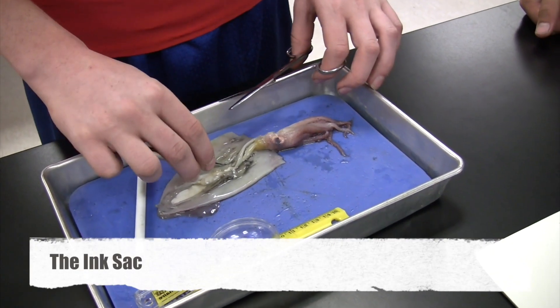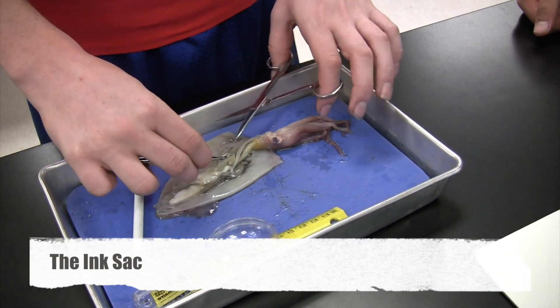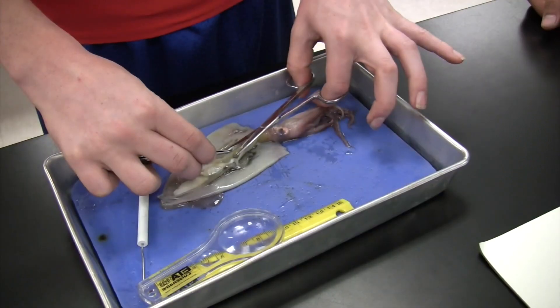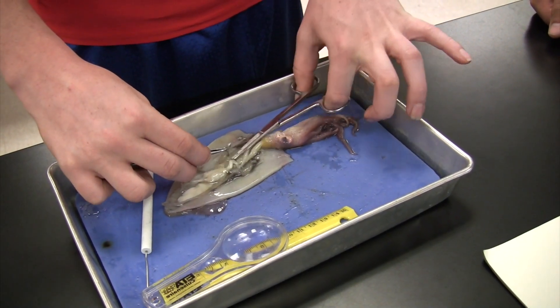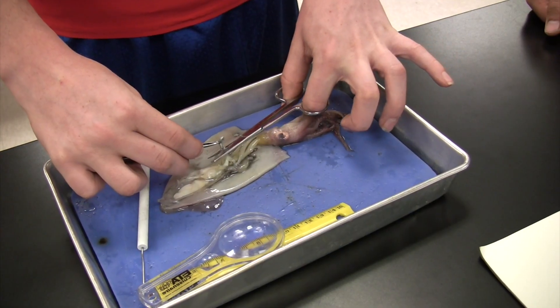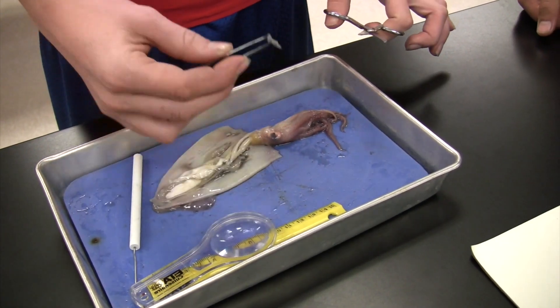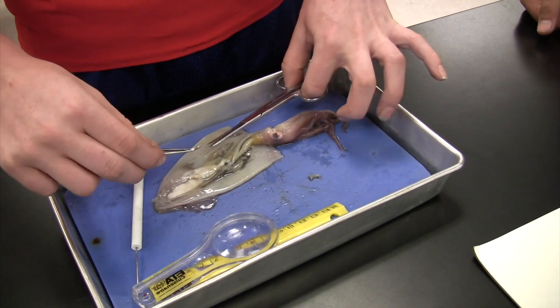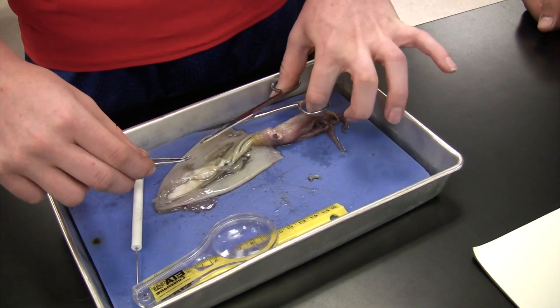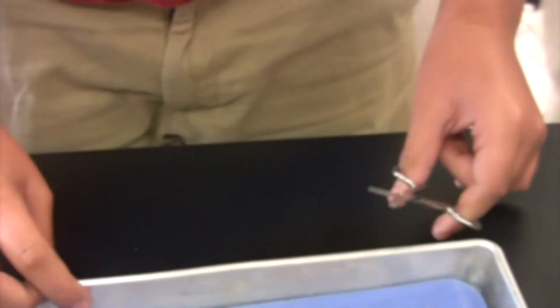This is the ink sac, and I'm going to pull it out. How can you tell it's the ink sac? It's silvery and it's right in the very middle. And how did you get it out? I lifted it with the forceps and cut it with the scissors. Will you show us how?